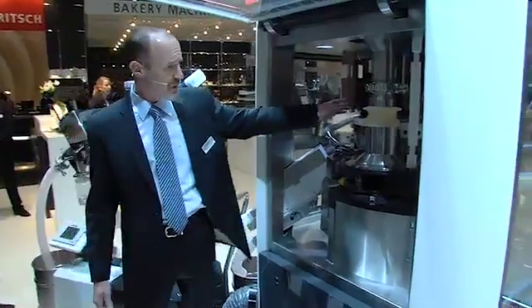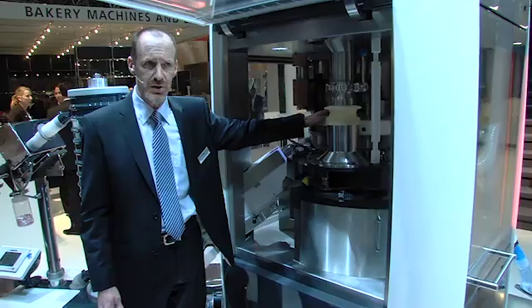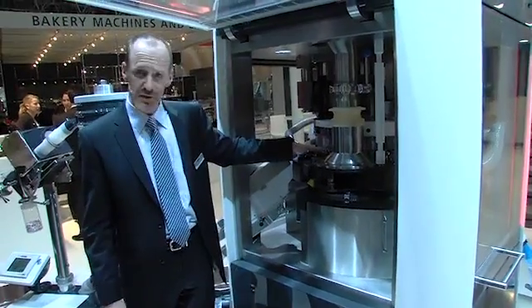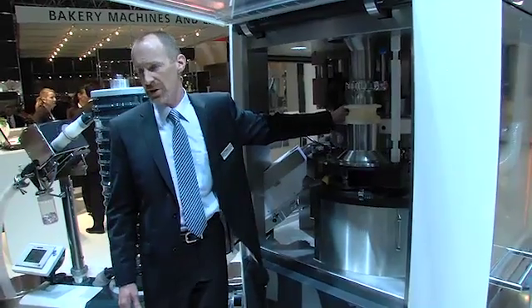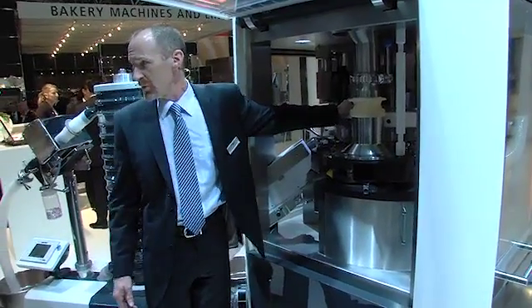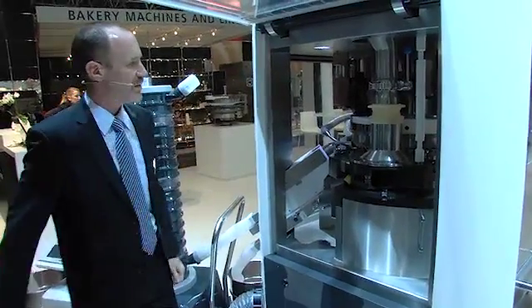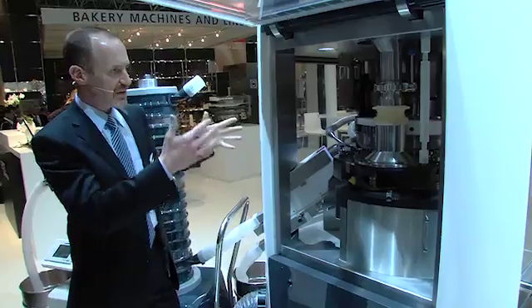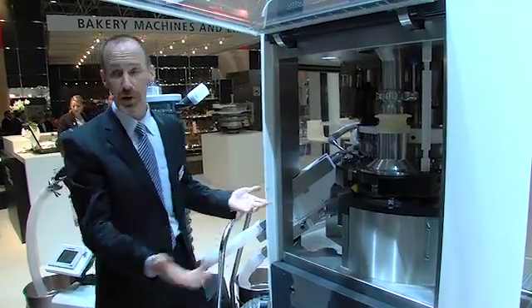However, by incorporating FEDA's PMAX turret technology along with the use of segments, you can install up to 87 stations on this tablet press. So when you put together the 1.6 square meter footprint and the 87-station turret, it's the most efficient ratio of space requirements to output available today.